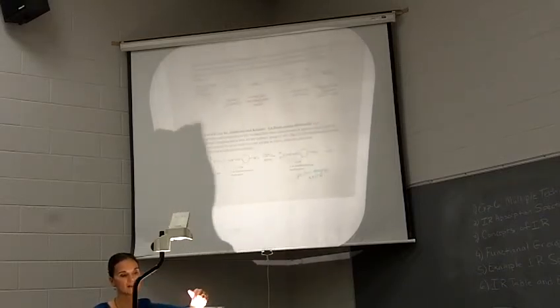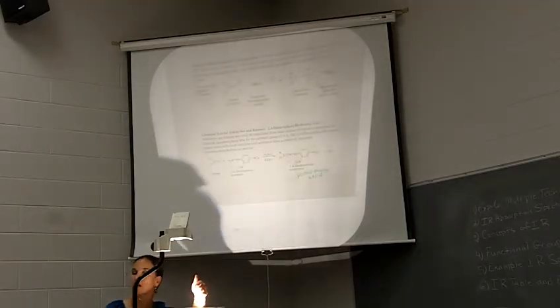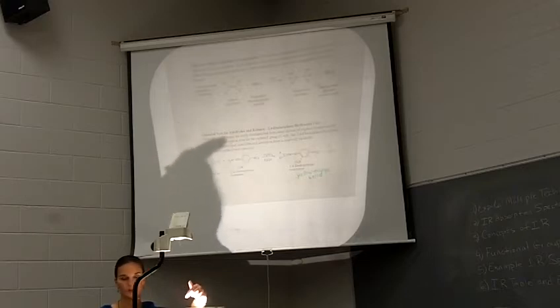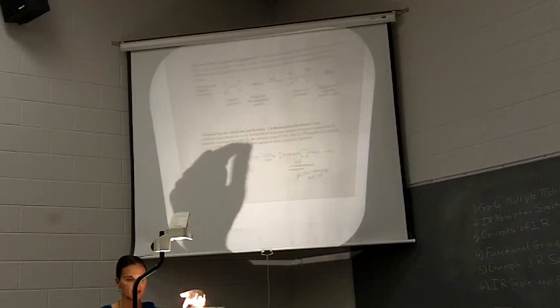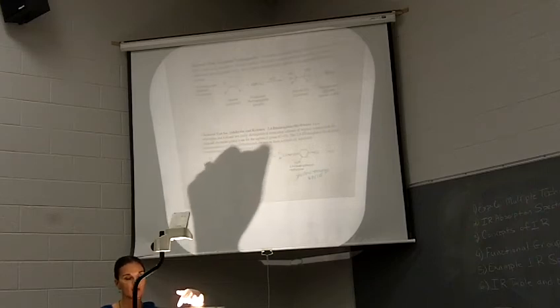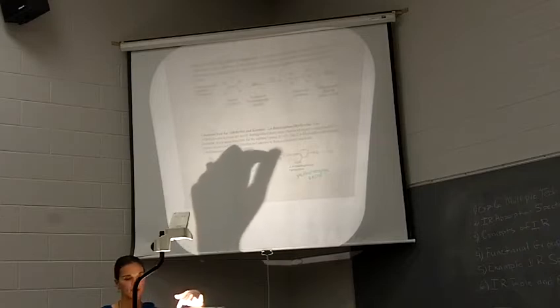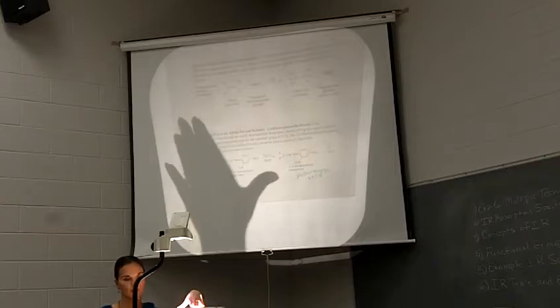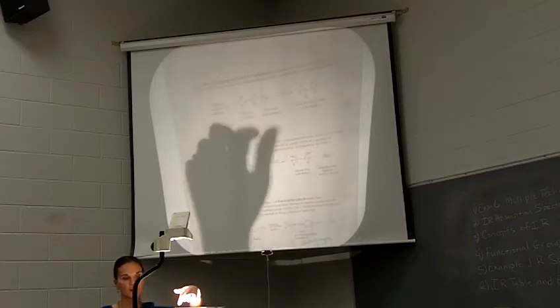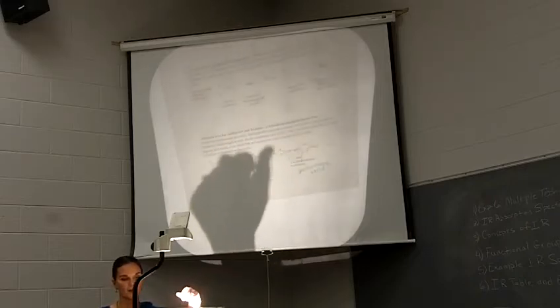For the DNP test, this is reacting with ketones or aldehydes. We only have a ketone possibility for this unknown, okay? So we're looking for it to react with ketones. The 2,4-DNP is 2,4-dinitrophenylhydrazine, so it's this species here, in sulfuric acid and ethanol, okay? So be careful with this one, it was made in concentrated sulfuric acid. Also, if you get any of this on you, it turns you orange really quickly, so wear gloves with this one. Wear gloves with these as well because you don't want the bromine or the permanganate on you, okay? Same with here, you don't want this on you.